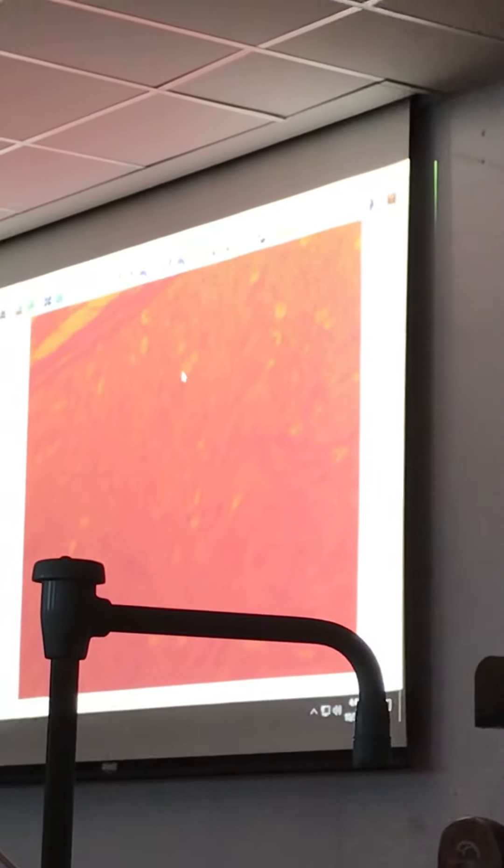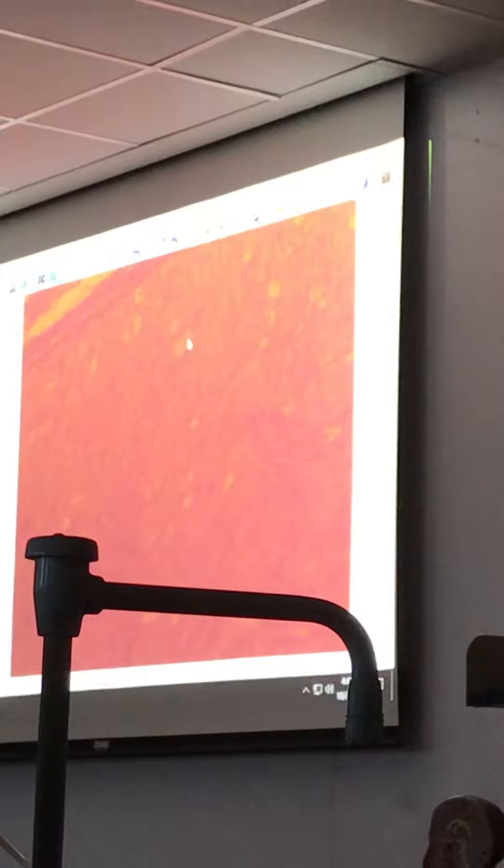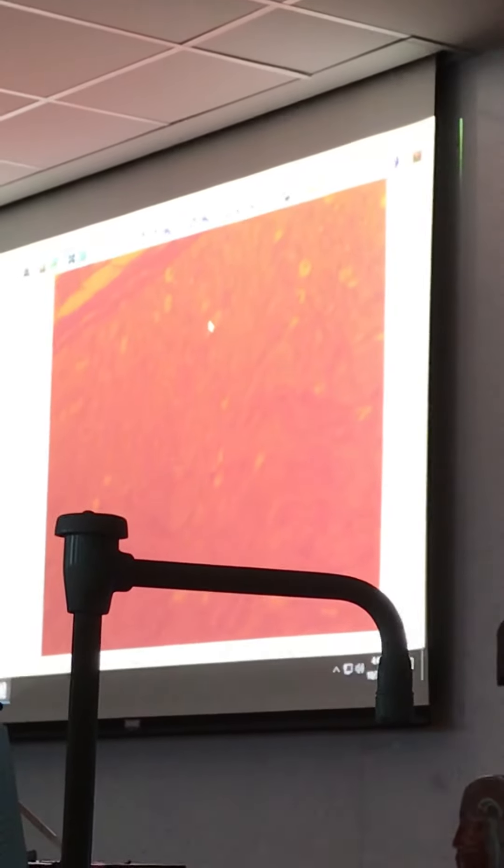If you can pay attention, you can see that the axon is actually moving in the middle of the section. So this is your axonal tract right here. This is your myelin sheath.